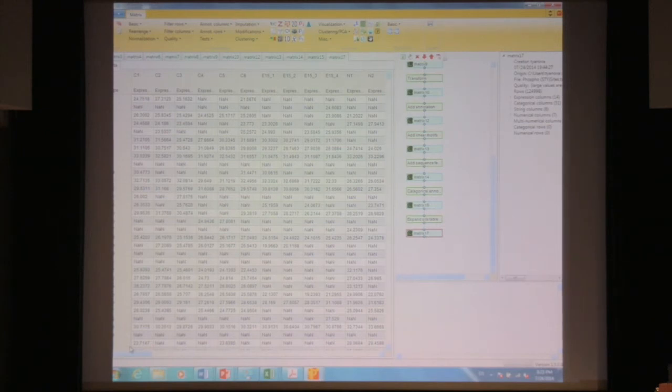Jürgen, do you use the experimental groups when you expand the site table? On the site table expansion function, I got an index out of range error. I've gotten this for a couple of other functions in the past. I don't know how to fix that. I mean, that might be a computer specific thing.